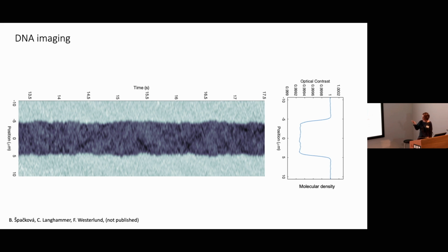But I show this basically just as an example of possible potential in the future to study DNA and protein interaction, where the protein would result in a detectable change of the intensity along the DNA, and maybe in the future we could help to address the problem with the dark proteins that the fluorescents don't see.